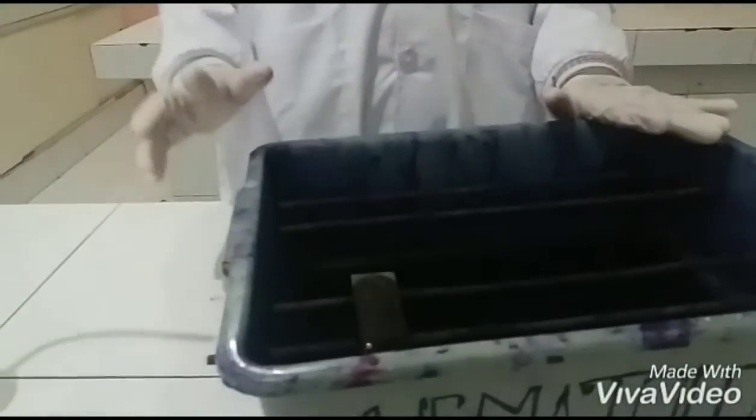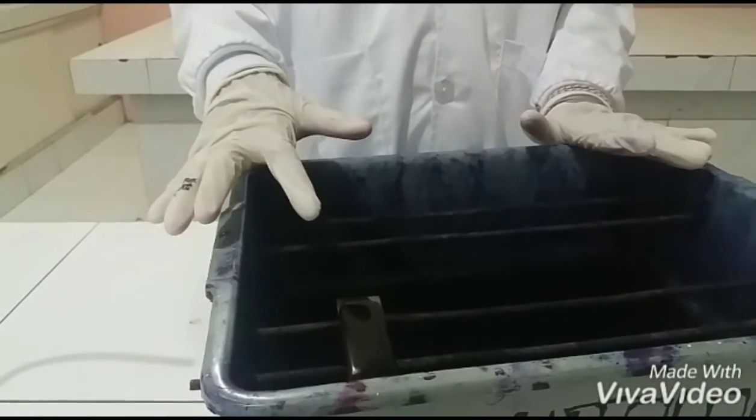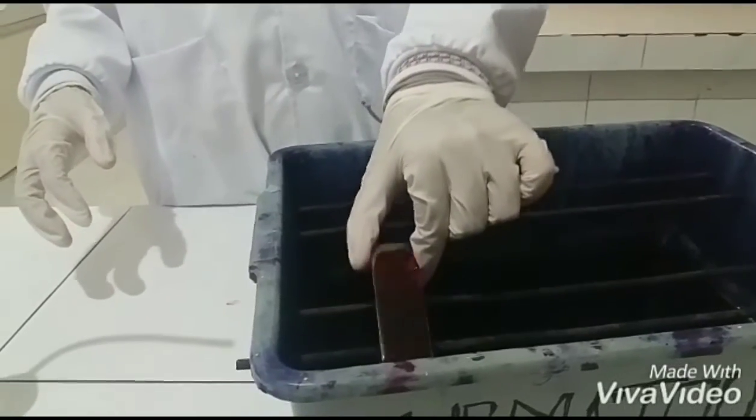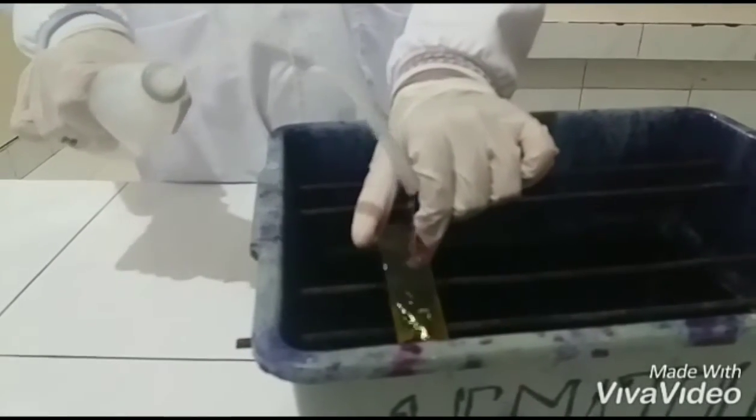In this method, we don't burn. So after 5 minutes, we throw away the Kinyoun and rinse with water, like this.